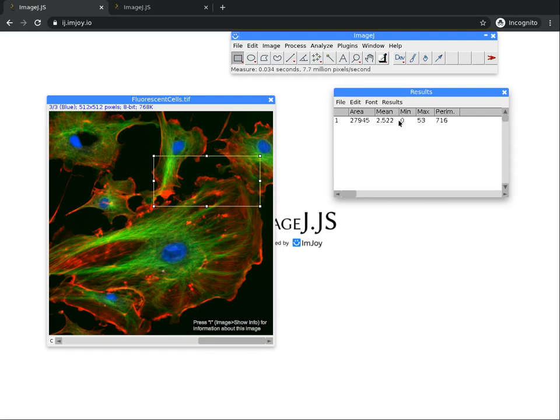We still have a 0 because the minimum value of gray in this area is 0. So don't forget, if you see 0 appearing in the numbers when you selected the measurements, only close the results tab and restart your measurement and you will see then the values appearing. This time you have all the desired data for the selected area.